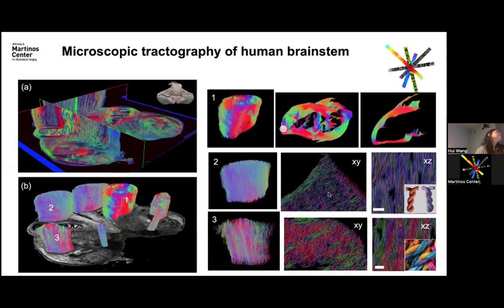With the current tractography, if we trace along that, what's shown in 2 looks correct at this zoomed-out image, but when you zoom in, the fiber looks like it's snaking this way. But what really happened, I believe, because we also see the cross sections of the fiber bundles in the intensity image and orientation, is that they really form like this.